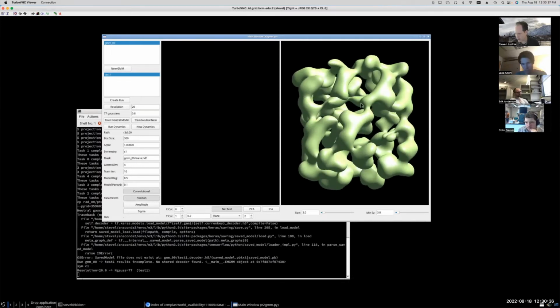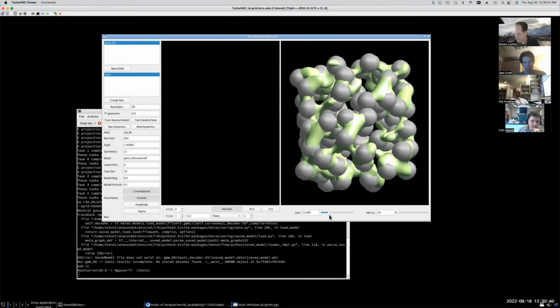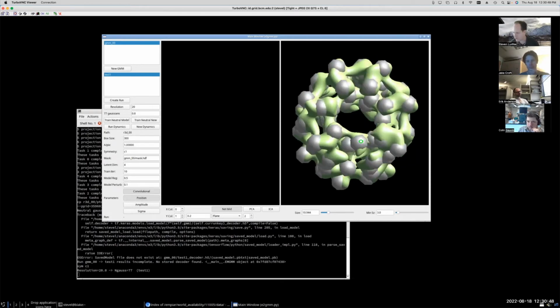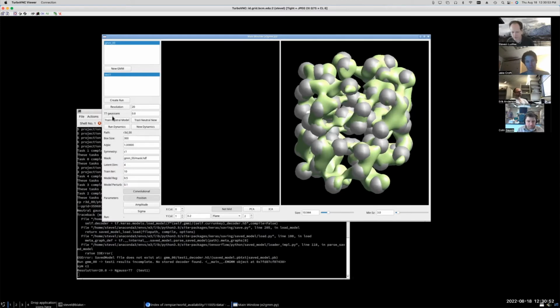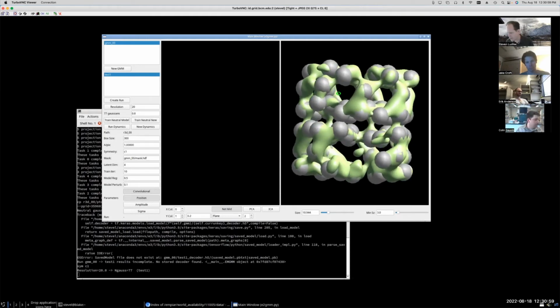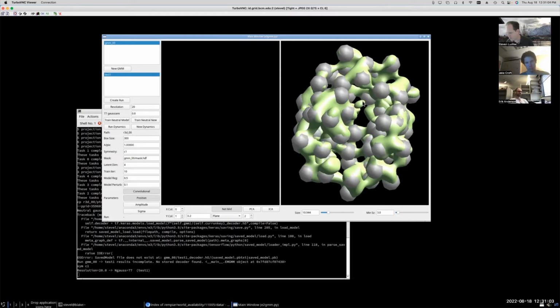And you can say, well, I don't see any Gaussians. Where are the Gaussians? Well, they're hiding underneath the isosurface, so I can make the Gaussians bigger if you're doing a coarse model here. If you're doing a high resolution model, the default Gaussian size will show up pretty quickly. So you can see how coarse the representation we produced is. You can also tell a little bit from the number of Gaussians. So is this too coarse, or is this about right? Well, there's an issue here, right? You'll notice that we don't have any Gaussians in this missing subunit.